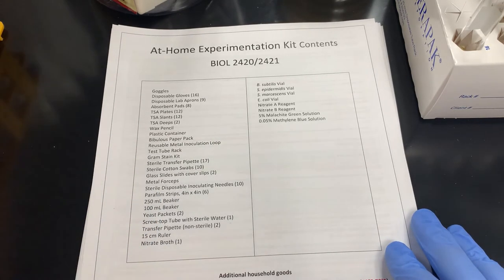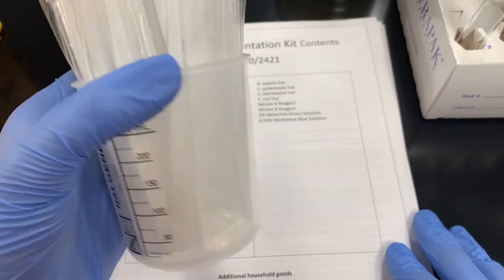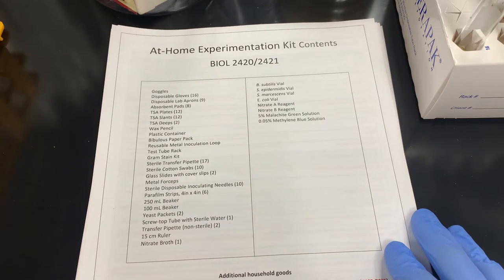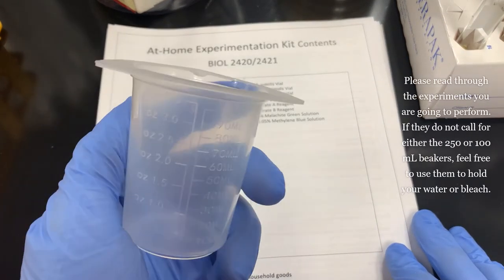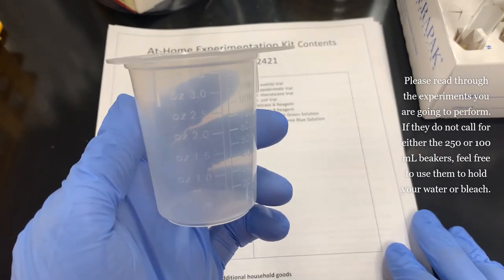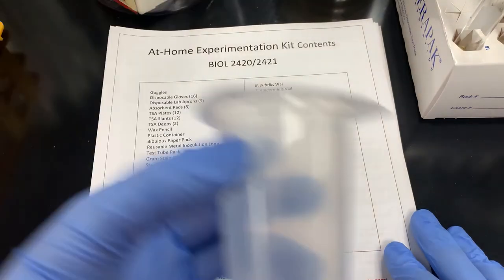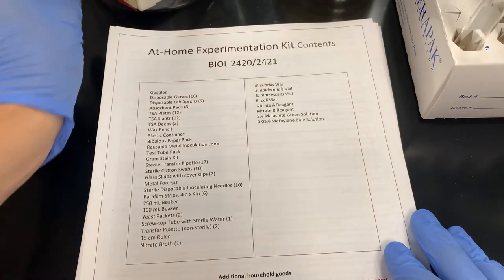You also get a 250 milliliter beaker. Now your transfer pipettes are gonna come in this 250 milliliter beaker. Okay, it says 250 on it, Nalgene. We also have a 100 milliliter beaker that looks like this. It's gonna be in your lab kit. Okay, the 250 is gonna be in the plastic tub. The 100 is gonna be in your lab kit. It specifically says they're 100 milliliters.